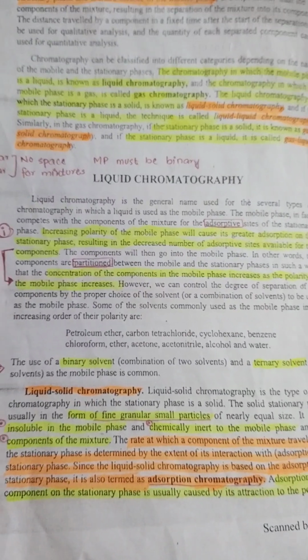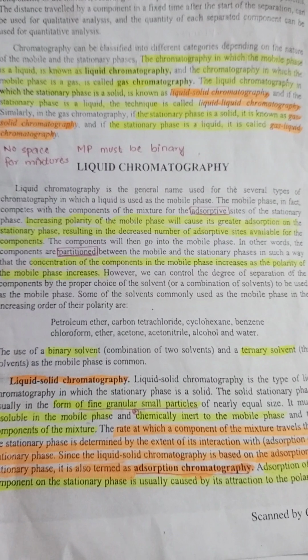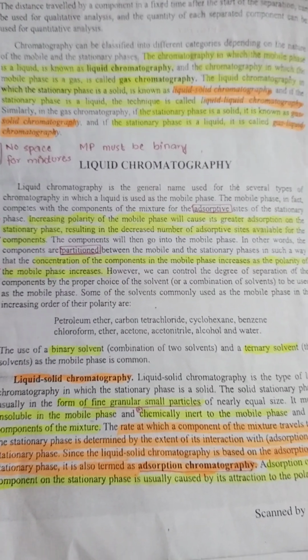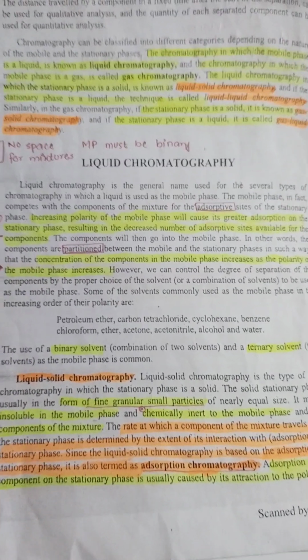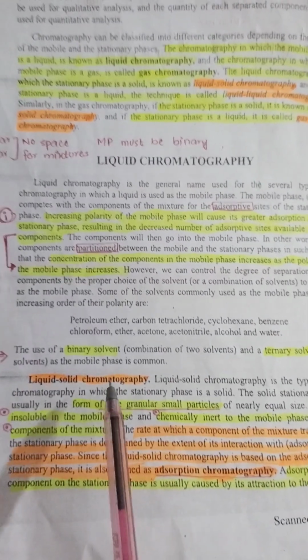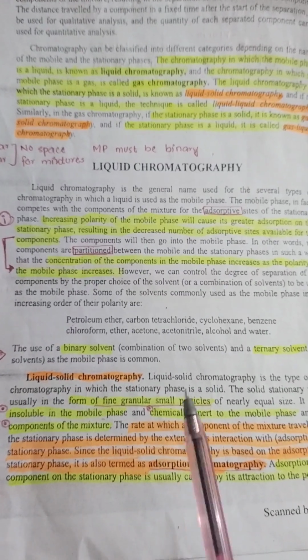Okay, what are the properties of the stationary phase? There are three properties mentioned: it is chemically inert to the mobile phase, chemically inert to the components of the mixture, and insoluble in the mobile phase. These three properties are required for the stationary phase that we use.